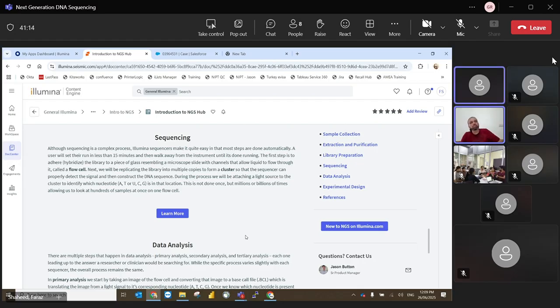Okay, your answer was very comprehensive. I really appreciate, and it was correct and perfect. So it uses ddNTPs, which will stop the polymerase activity, and the next base will not be added because dideoxynucleotide will stop the polymerase activity, because polymerase is active only with dNTPs. So this sequencing technology, which was Sanger sequencing, in other words, you can say it was sequencing by termination. Okay, so it used to terminate the chain.